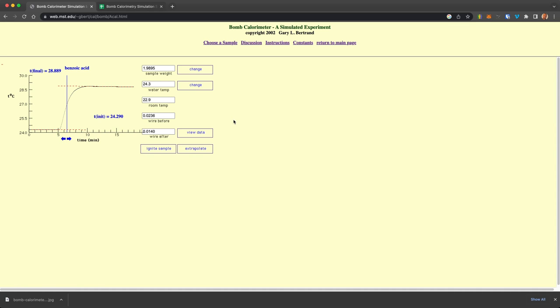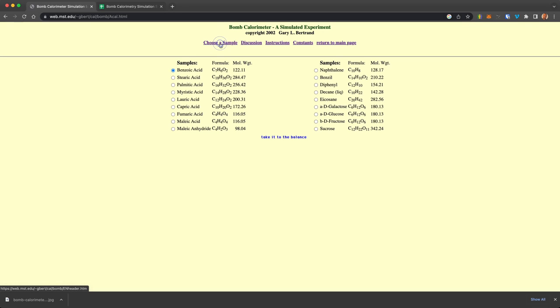You would start by calibrating it with benzoic acid, and now we would choose a different sample that we want to measure.